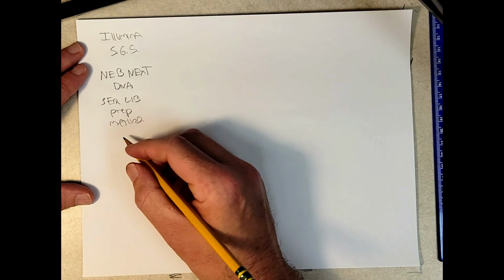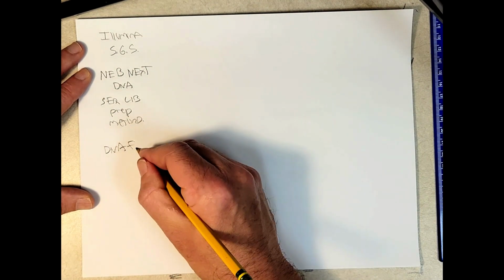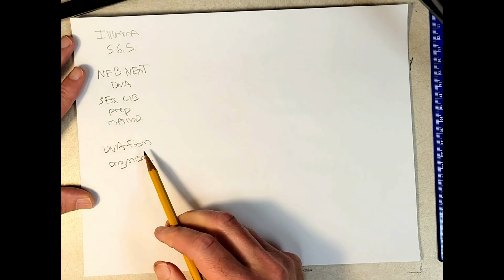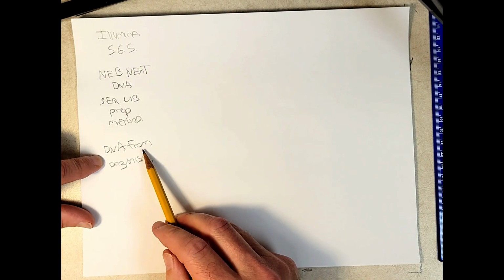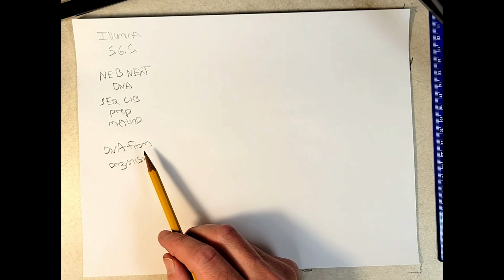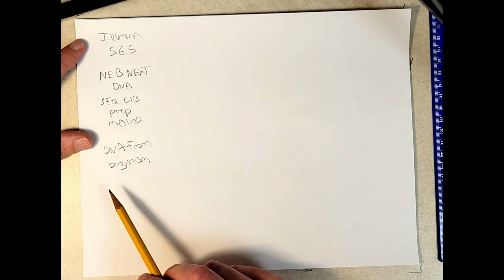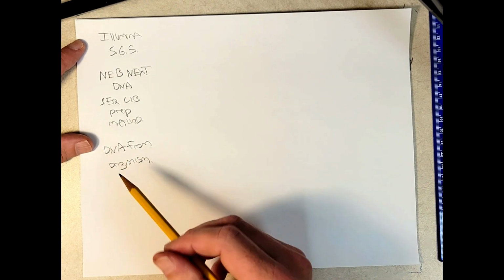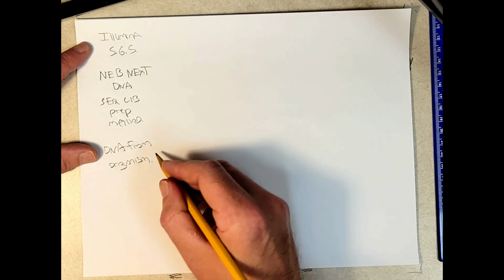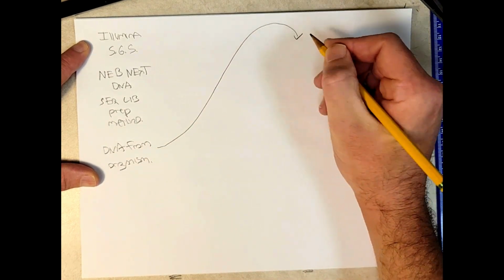So the first step is to get DNA from the organism. Now this is something I haven't talked much about yet this semester: how do we get DNA? There are special kits designed by biotechnology companies that make the process of isolating DNA from tissue relatively easy. So let's just start with, we're going to get DNA from an organism. And once we have that DNA, we can start preparing the library.